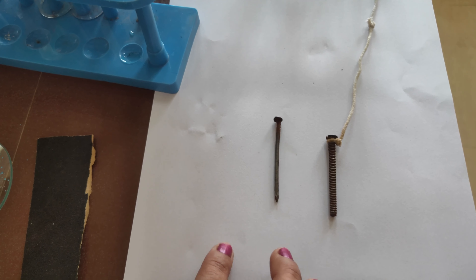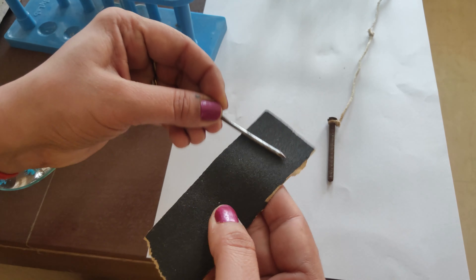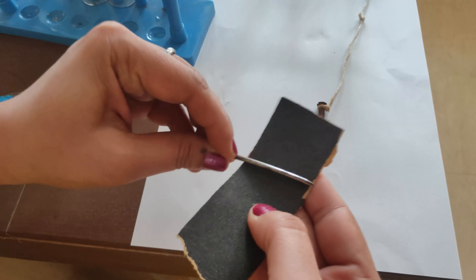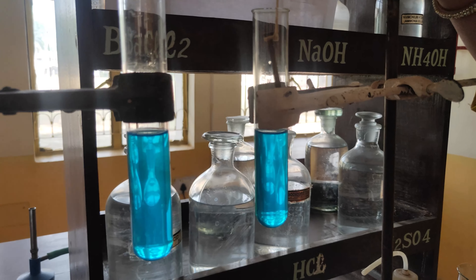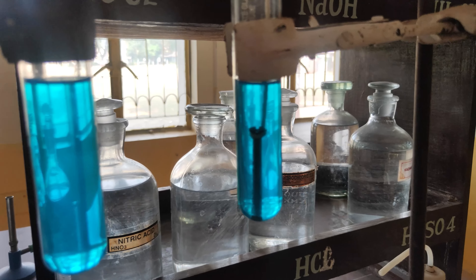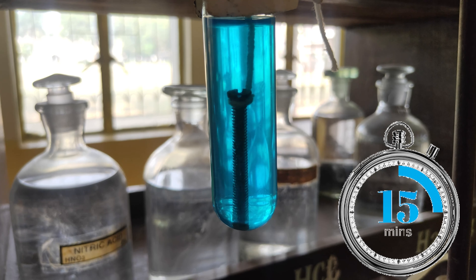Take two iron nails. Clean these by rubbing them with sandpaper so that their colour appears greyish. Tie one nail with a thread and immerse it into one of the test tubes containing copper sulphate solution. Keep the test tube undisturbed for about 15 minutes.